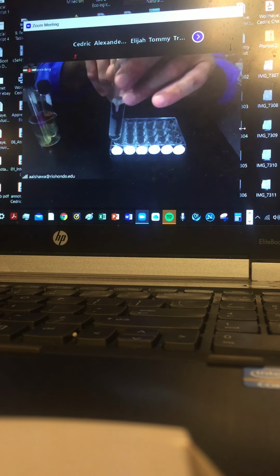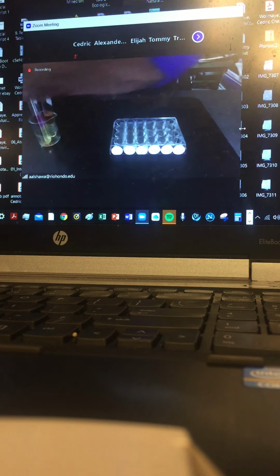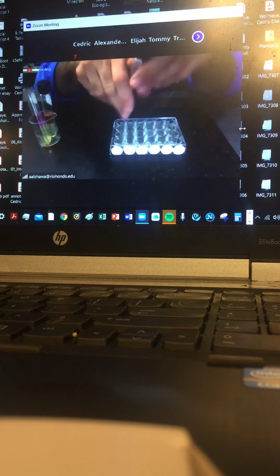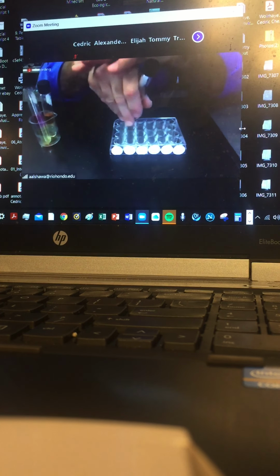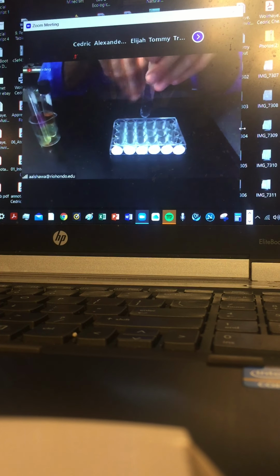Definitely chlorine is molecular and resists being infused in the water. So here's a picture of that chlorine, basically a hint of yellow. Once in the water, it doesn't like to be in the water, but you can just keep pressing it and pushing it in to infuse it. Eventually, a portion of it will be infused.